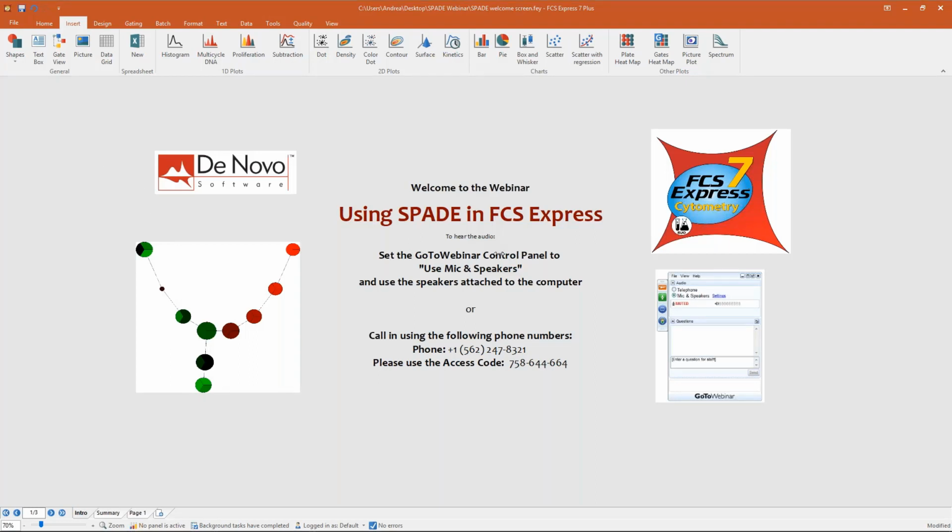Also, basically, what can we learn from SPADE instead of t-SNE and vice versa? I mean, it's hard to say, those are completely different approaches. In t-SNE, you're still dealing with single event values, and you're just reducing the number of dimensions. You still have the visualization, so you're grouping events together graphically in the t-SNE map, but you're not creating groups.